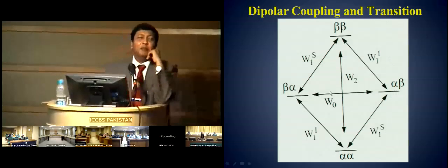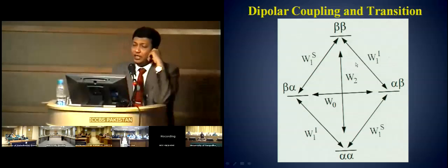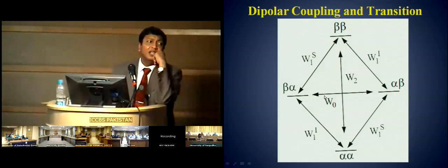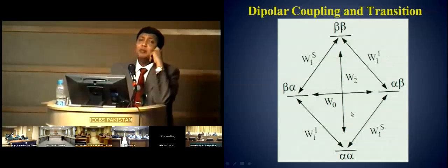So by pumping lots of energy into the system, forbidden excitation and forbidden relaxation start playing their game also. This happens only in case of NOE. Only in case of NOE would you be able to see a double quantum relaxation, in order to achieve a thermal equilibrium.